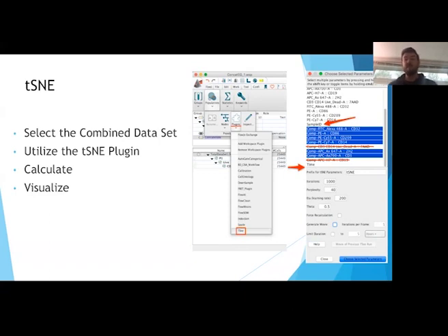You can perform a downsample step for concatenation if you want to include only a certain number of events, maybe the number of events in your smallest population when you go to concatenate. So the downsample plugin, which is actually illustrated here in this list of plugins, is a really useful one for people that want to normalize the number of events that they're including from each population or from each sample. So absolutely, great question. Keep those coming.